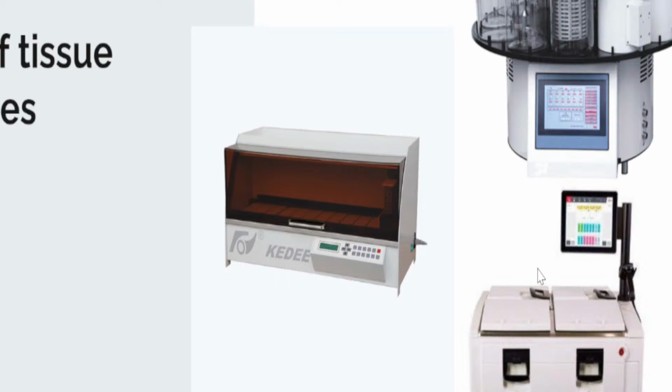The chemicals are pumped into this container, this vat over here, which drowns the samples in the chemicals, whether for fixation or for clearing, it doesn't matter. There's a protocol also, that's the reason why there are computers. You see a computer system, a monitor there.